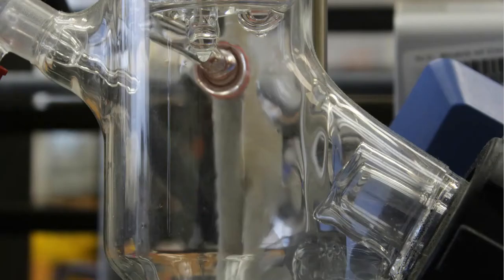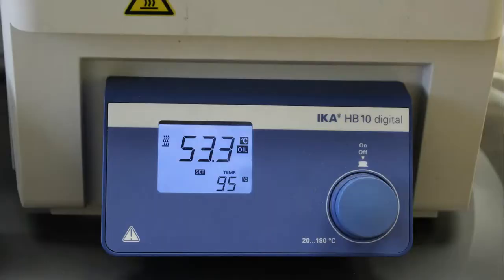All right, so as this begins to heat up, you're going to see the petroleum ether getting distilled off. I know it's getting distilled off because I'm seeing some droplets forming here on the bottom of the condenser. Again, this is very good news. Here at 53.3, and the boiling point range is 40 to 60, I should be getting quite a bit of petroleum ether off at this point, right? I've cranked this thing up to 95 just to get it hot enough to ensure that everything comes over that is maybe above 60, if the labels lied to me. But that's one of the reasons that I'm starting to see distillate, because we're at a low boiling point, and also one of the reasons that I'm seeing distillate before it's even made it to the 95 degree mark.